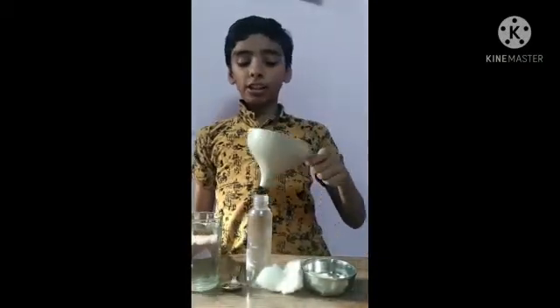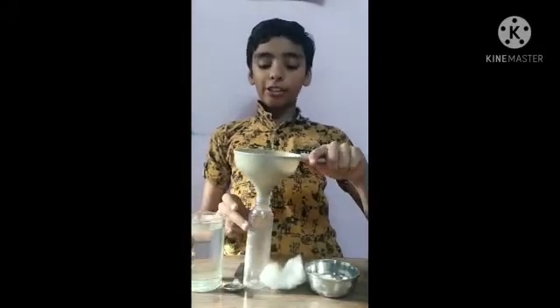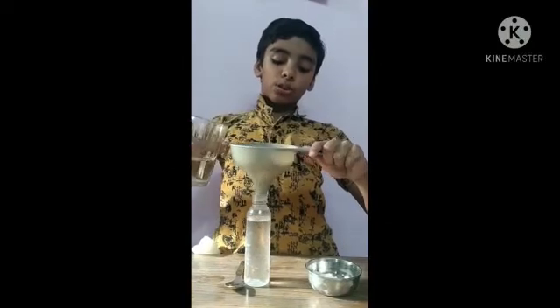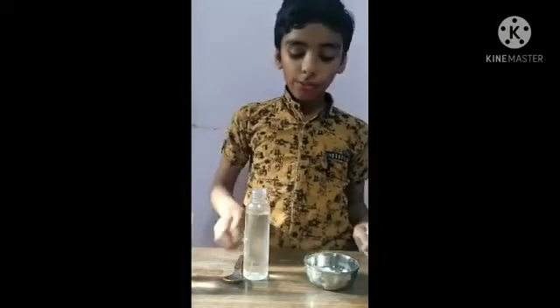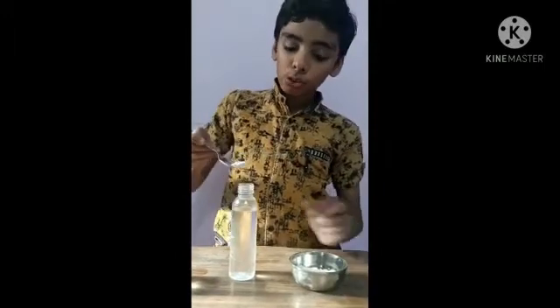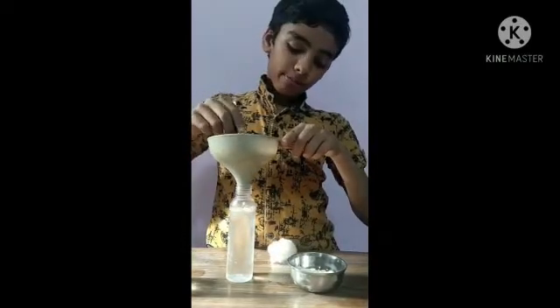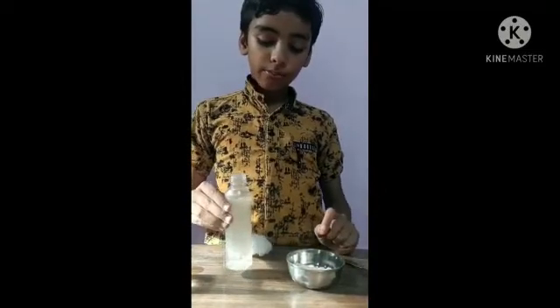So I am taking a funnel and I am going to pour this sugar solution into it and fill 2/3 of it. So it's done. So let's take some yeast powder. So I am taking half a teaspoon of it. So I can also transfer it by this. And we will shake it a little bit.